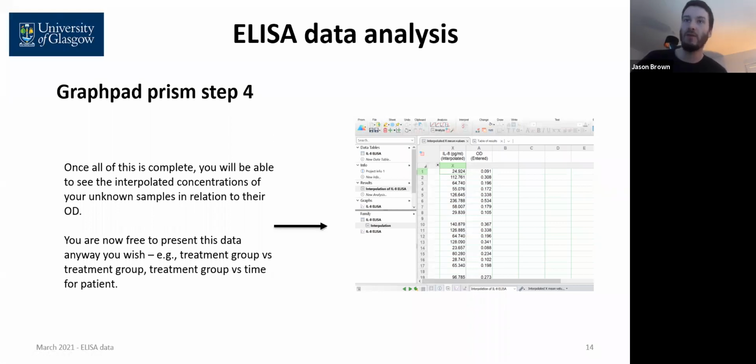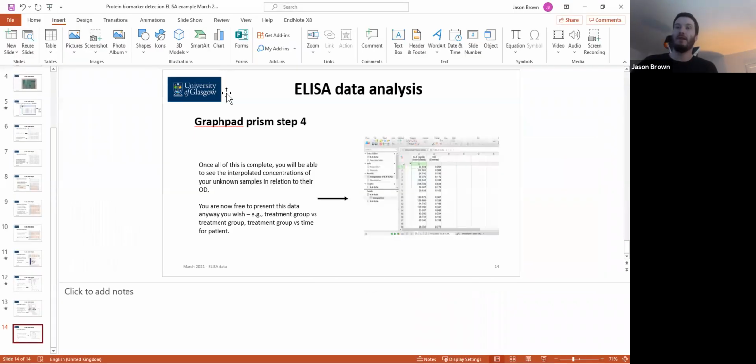Okay, so that brings us to a close for the data analysis of the ELISAs. Hopefully, as I've said, that should be quite self-explanatory, and if you follow that process step by step, then you should be able to get some nice data at the end, and then you have a clean slate to basically go away and present that data any way you wish.